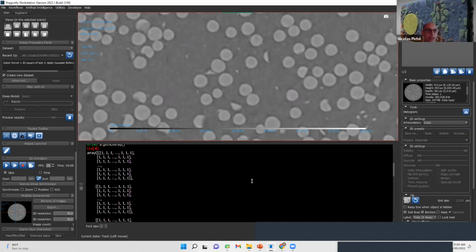Yeah, well, we will do deep learning tomorrow. So the segmentation wizard and the deep learning tool, and also machine learning. But what you want to do is segmentation wizard. Yesterday, someone came and said, my data set, I'm not able to segment it. It was difficult. It was a phase contrast of something, and I was able in like 15 minutes to segment it, and it was almost right. Before, it was not possible.